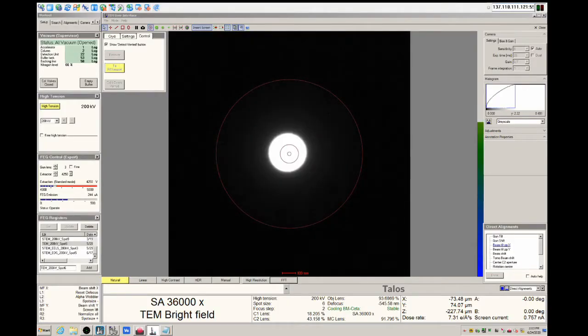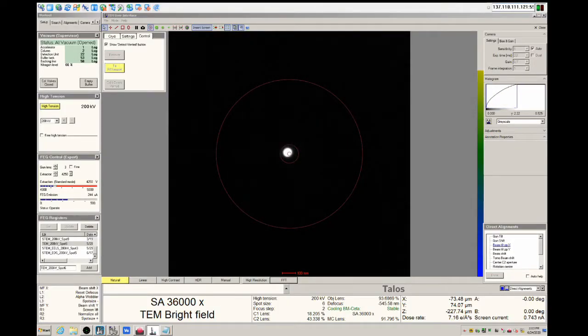Next, we want to double check the beam shift. Go to direct alignments, beam shift again. And with a very small spot, use the multifunction X and multifunction Y dials to center the spot. Next, go to direct alignments and we want to do the beam tilt PPX alignment.